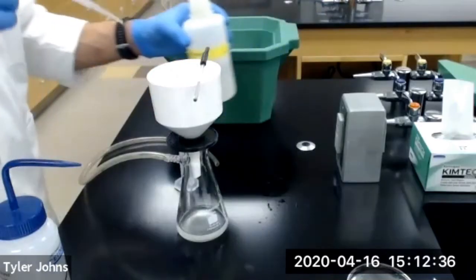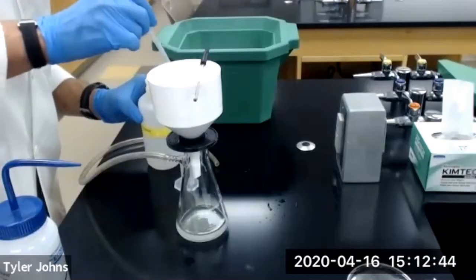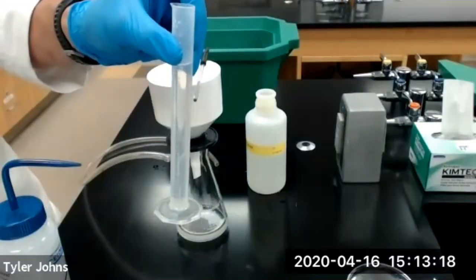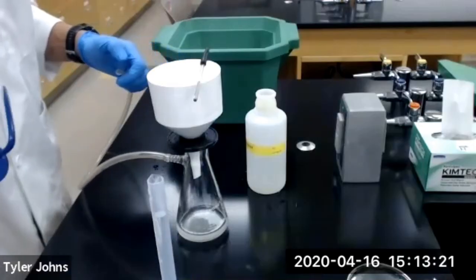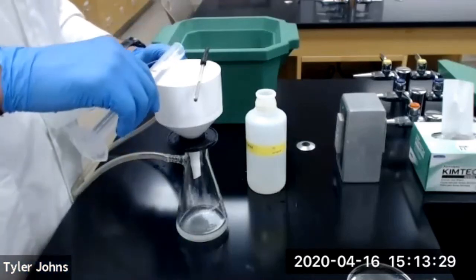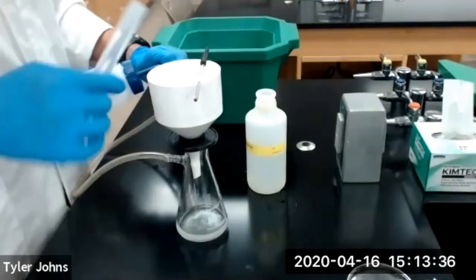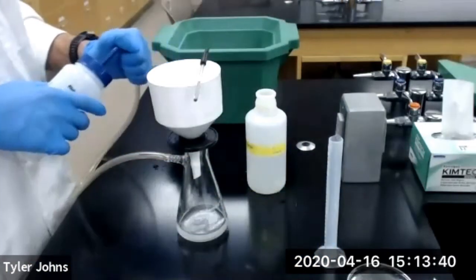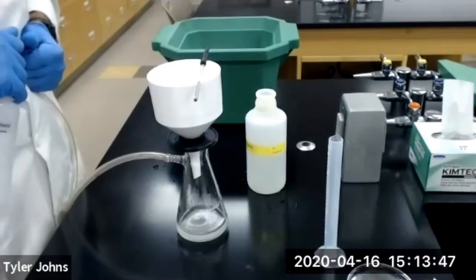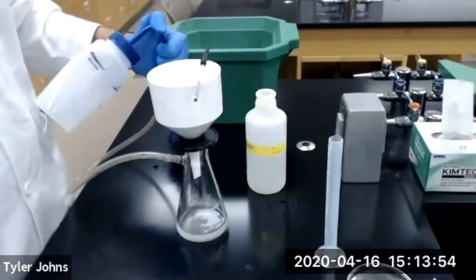I'm next going to wash my crystals after it's filtered with about 20 milliliters of 95% ethanol. Okay, so I have about 20 milliliters of 95% ethanol here. We'll set the vacuum back up. I'm going to wash with the 95% ethanol. It's going to wash the crystals, but it's also going to help the crystals dry. And I'll continue vacuuming until we get all of that 95% ethanol washed through the filter flask.